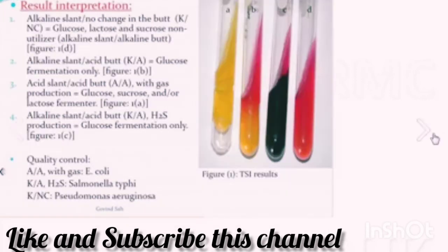Now the result interpretation. This is called the butt and this is called the slant. Alkaline slant and no change in the butt occurs in case of glucose, lactose, sucrose non-utilizers. Alkaline slant and acid butt occurs in glucose fermentation only.